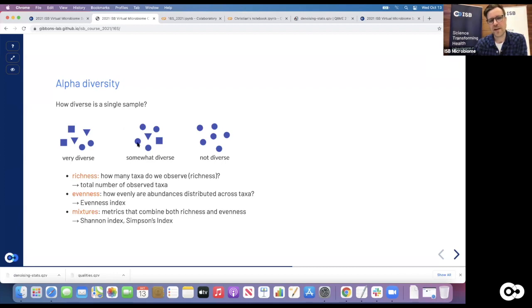Even though in the second one I have 3 organisms, I might draw a circle organism, then another circle organism, and I wouldn't be particularly surprised since I already observed the circle organism before. And if I have a super non-diverse environment with only a single organism, after I've drawn a few random organisms from that environment, I'm not surprised anymore. That's one interpretation of the Shannon index.